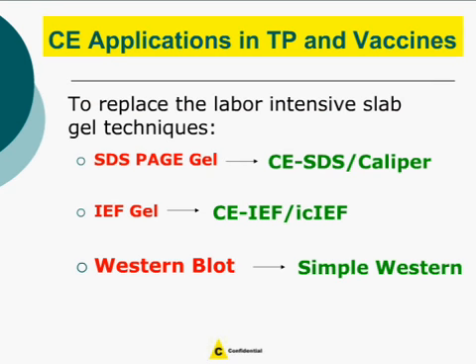In the past 2 decades or so, capillary electrophoresis has grown as a powerful separation technique with high separation efficiency and low sample consumption. In addition to these advantages, compared to the traditional slab gel techniques, CE also has advantages such as speed, the ability to quantitate, and the ability to automate. For these reasons, many are working to develop CE methods to either complement or replace the more traditional, labor-intensive and time-intensive slab gel techniques.